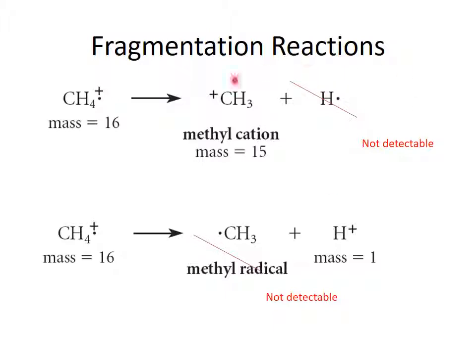Okay, well, let's go ahead and look at what happens if we were to do a mass spec on methane. We would see a molecular ion of 16. And what we actually see is it throws off a hydrogen free radical and forms a relatively large peak with a mass of 15. Why am I showing this to you? Because I'm just showing you that in the fragmentation patterns that occur, hydrogen free radicals can be thrown off. What is detected though? It is the cation that is detected.